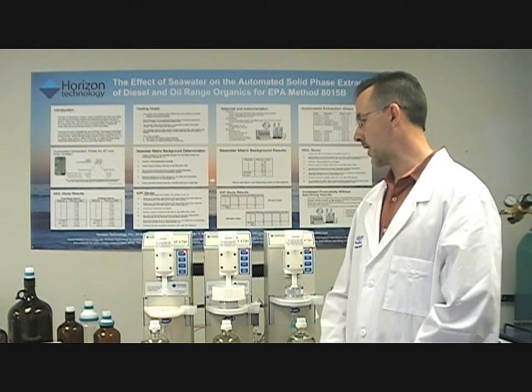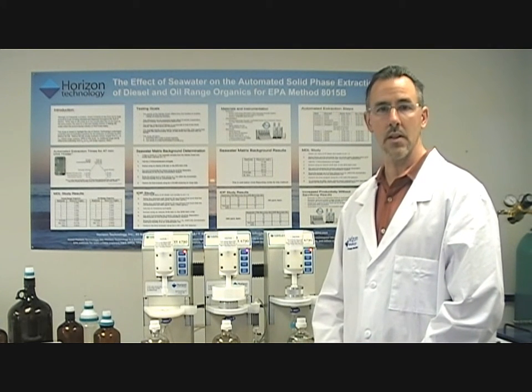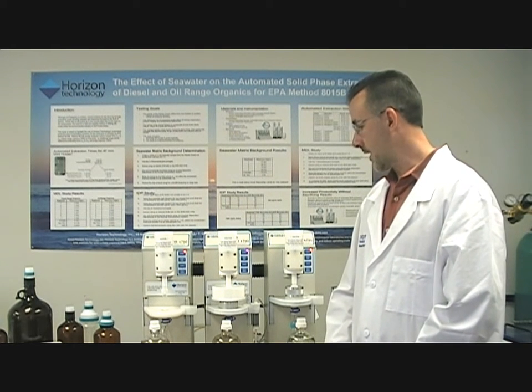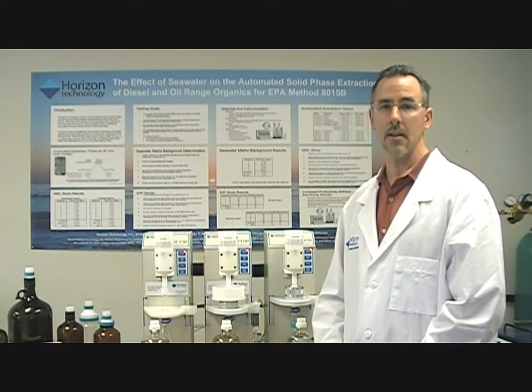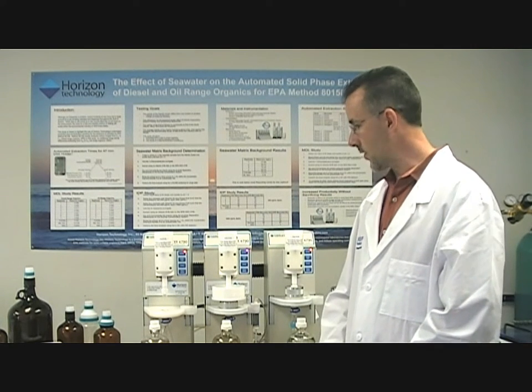Up until now, most environmental labs use manual techniques like liquid-liquid or continuous liquid extraction for processing these types of samples. There are complications that arise when using those manual methods, such as emulsions. They can take a long time — 24 to 48 hours to process a sample — and often lead to high rates of re-extraction.